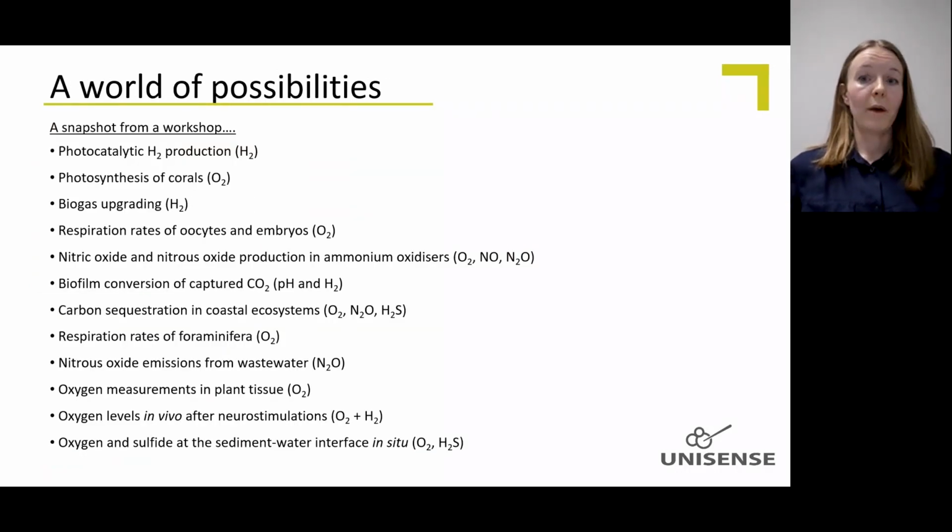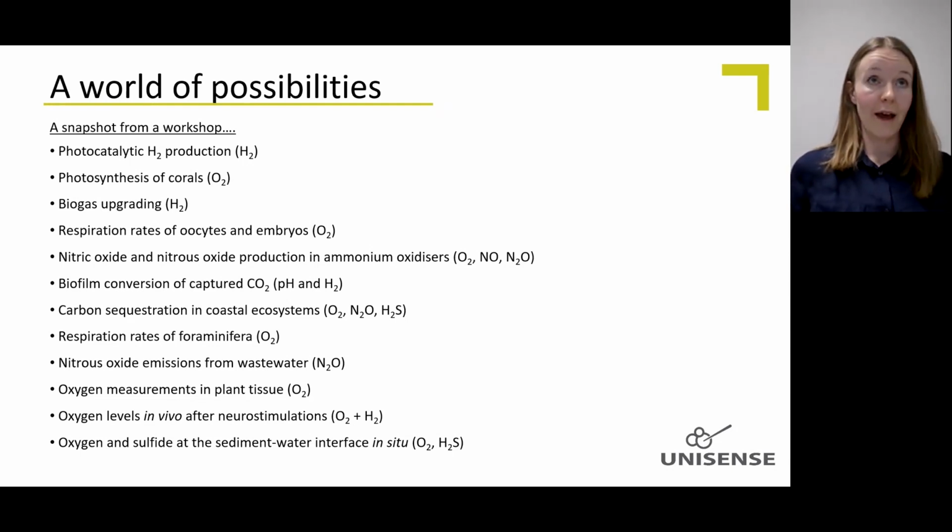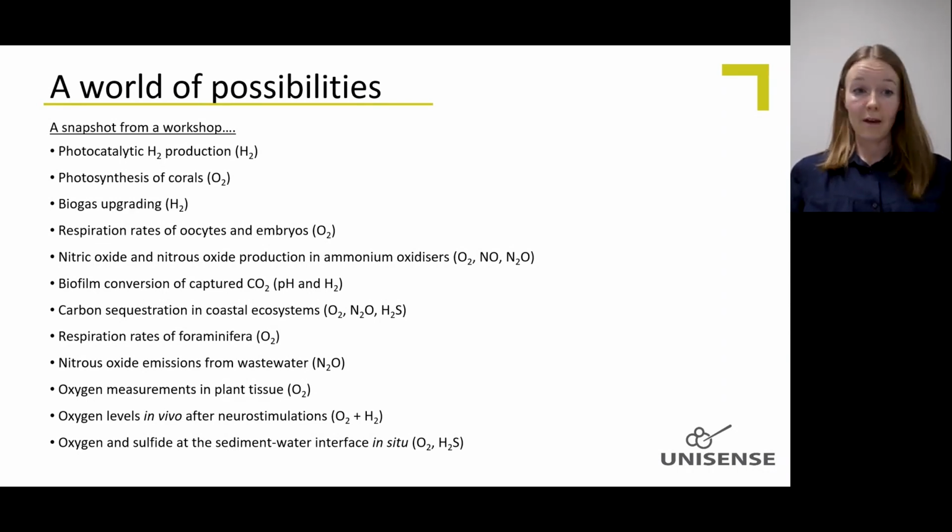This is a snapshot from a workshop. It's just to show you how many different types of samples we see. We had researchers working with photocatalytic hydrogen production, photosynthesis of corals, biogas upgrading, respiration rates of oocytes and embryos, nitric oxide and nitrous oxide production in ammonium oxidizers, and biofilm conversion of captured CO2, making pH and hydrogen profiles in the biofilms. We had someone working with carbon sequestration in coastal ecosystems.